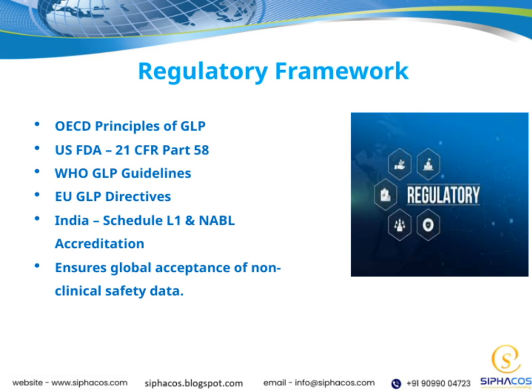Let's take a closer look at the key regulatory frameworks that underpin good laboratory practice, or GLP. First, we have the OECD principles of GLP, which serve as an international benchmark for quality and consistency in non-clinical safety studies. These principles help ensure that data generated across different countries can be trusted and accepted worldwide. Next, there's the US FDA's regulation, specifically 21 CFR Part 58. This set of rules provides detailed requirements for conducting GLP studies in the United States, emphasizing compliance and data integrity.